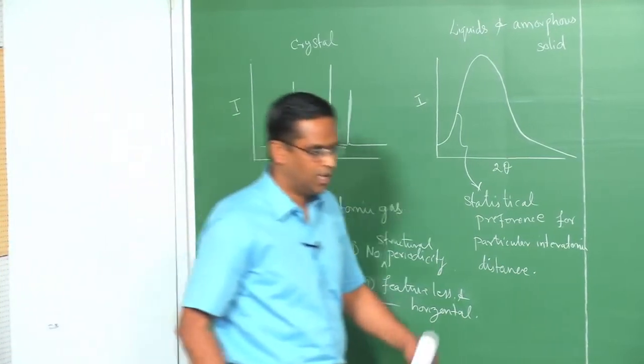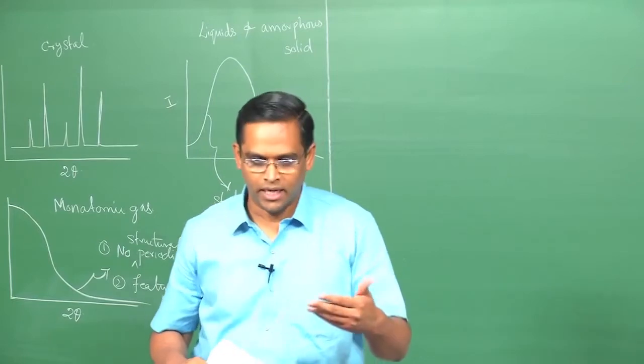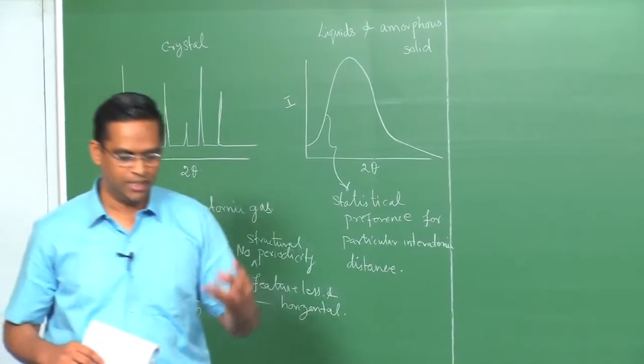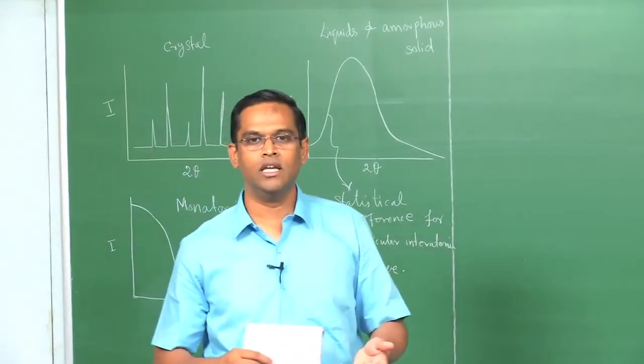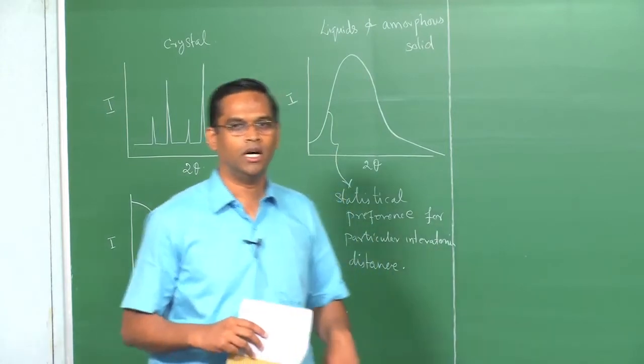So, now let us come back to the X-ray diffraction peak, where you have the contribution from the crystal size as well as the strain effect of the lattice. So, how to separate them, that we will see now.